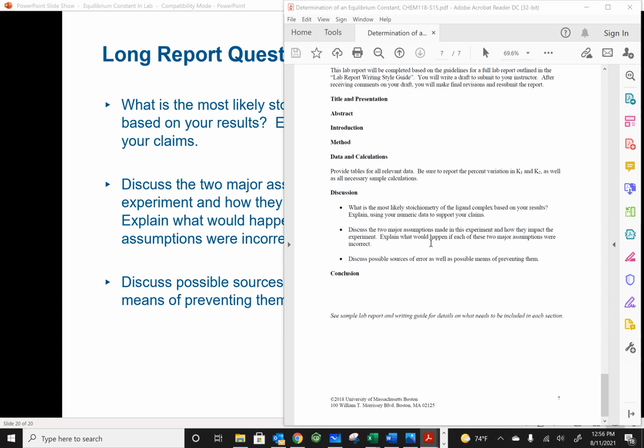So let's go back to Beer's law. Remember that Beer's law is only applicable to concentrations that are within a certain region, right? When you're making a concentration gradient, you have a linear portion of the data, and then when it gets too concentrated, it starts to plateau off. The accurate data that you can get is only within that region. So in this experiment, we have to assume that the ML complex concentration is within that linear region, because if it's not, then we can't use Beer's law.